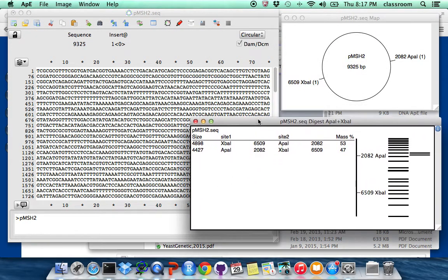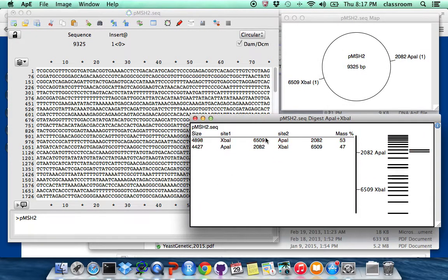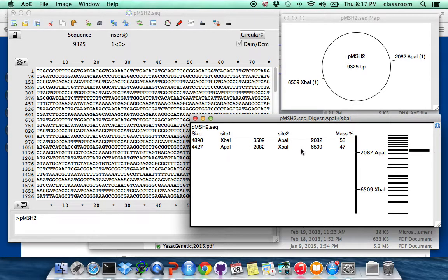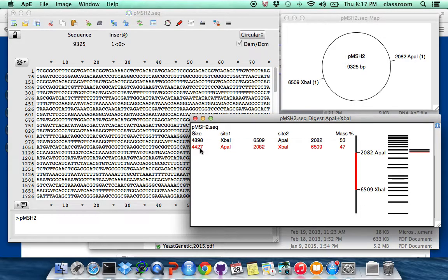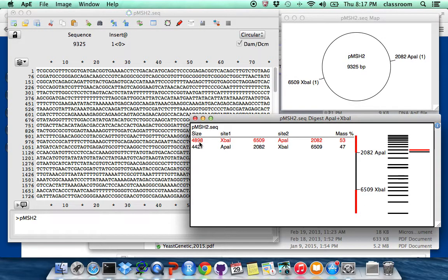It's actually cut it automatically. So if you recall, we should see two fragments, you need there are two fragments here. One is 4427, the other one is 4898.